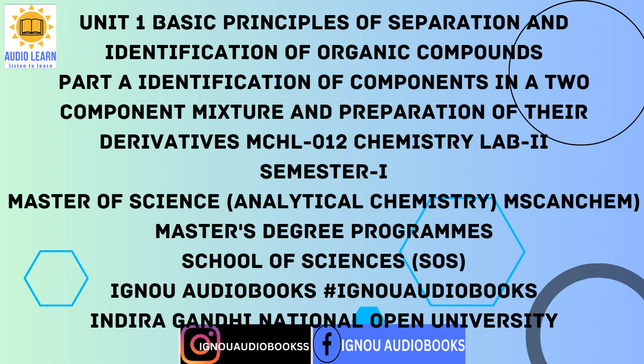Expected learning outcomes. After studying the contents of this unit, you should be able to explain the general principle of separation of organic compounds from their mixture, carry out such separation of components of the mixture after ascertaining their nature as acidic, basic or neutral, characterize the functional groups present in the separated compounds by performing their characteristic tests, and identify the separated compounds using their physical constants and prepare their suitable derivatives.